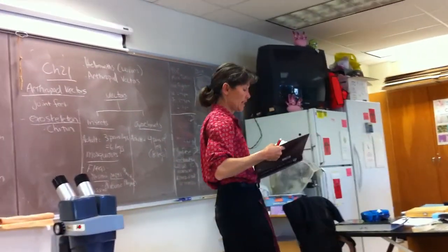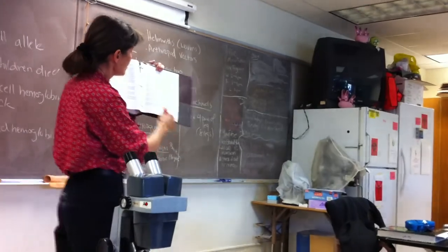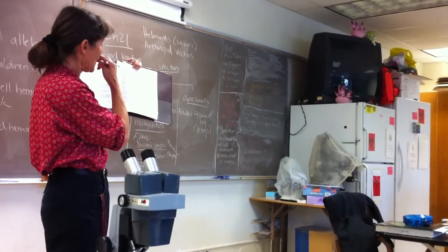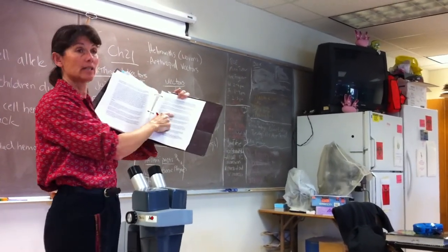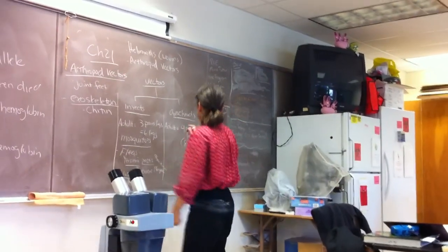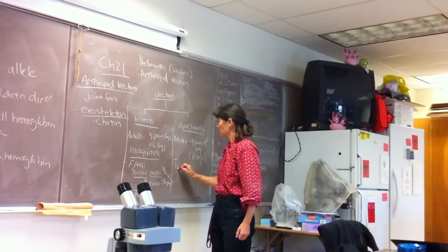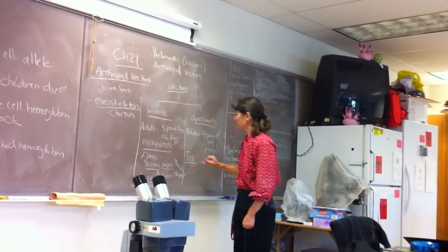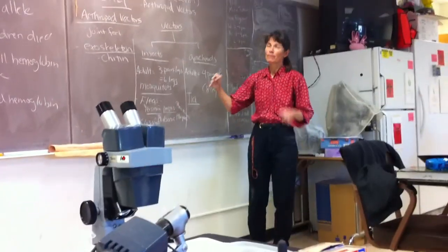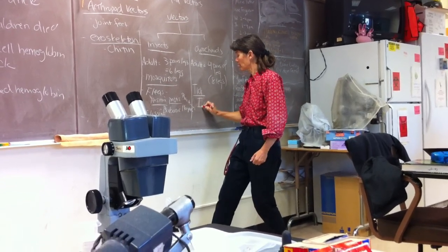Okay. Now, the only arachnid we have for you guys to look at, and I did the insects first. On page 180, if you go up to number 5, it says observe the Dermacentor tick. Okay, so we want to remember that ticks, as adults, have 4 pairs of legs, so they're arachnids. Okay, so we'll just put ticks here. And the tick that I would actually like you guys to remember, because it's such an important vector here in California, belongs to a different genus. It's called Ixodes.